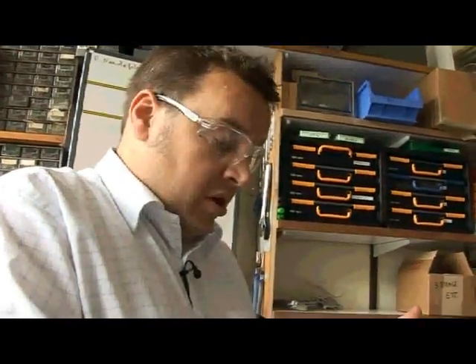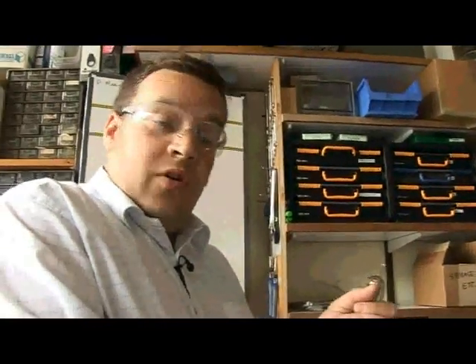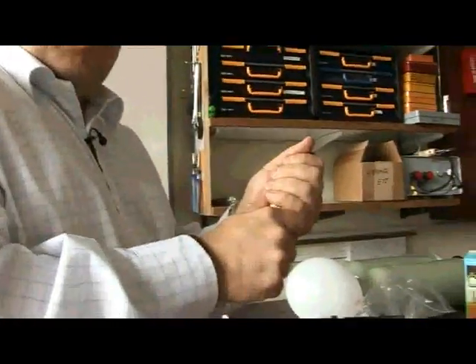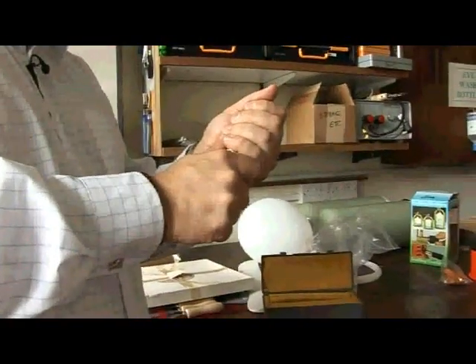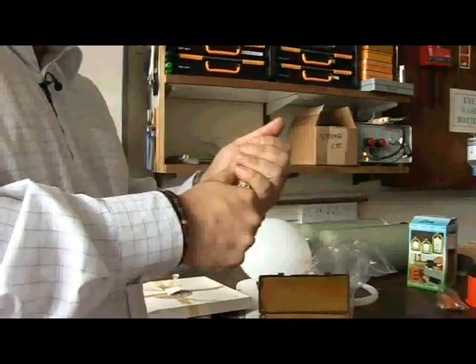So that's really quite close to room temperature in very many laboratories and in very many environments. Perhaps like in Spain or perhaps in other areas which are nice and warm. So if I stand here long enough and I heat the cesium with my hands, which obviously this is body temperature, hopefully we might be able to see that the cesium itself will melt. So we'll be able to see liquid and solid cesium.